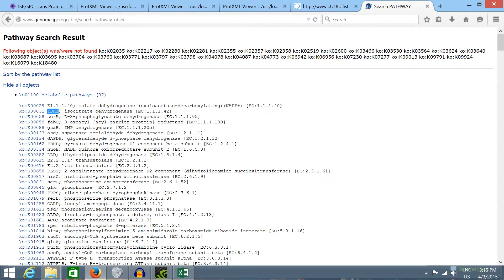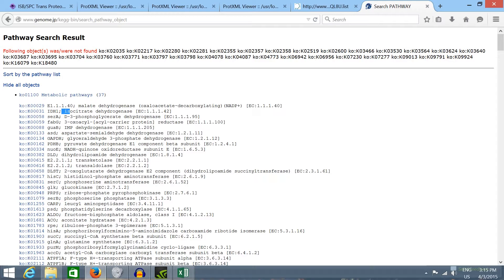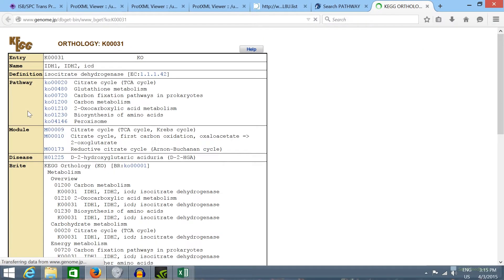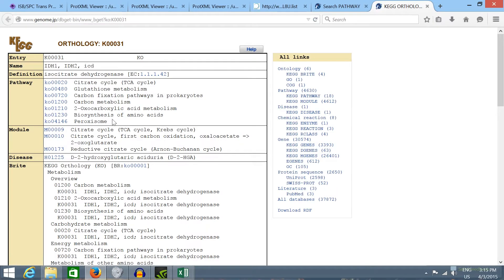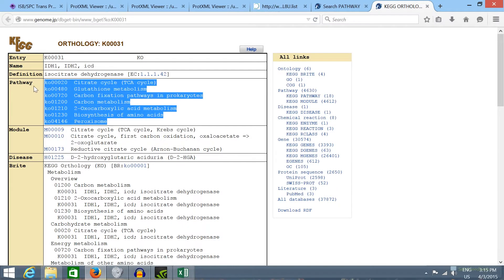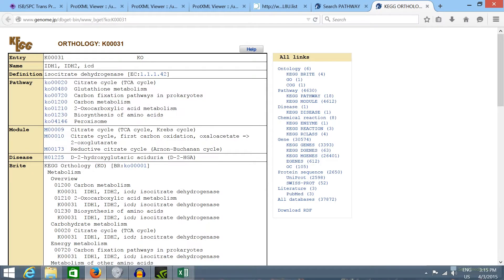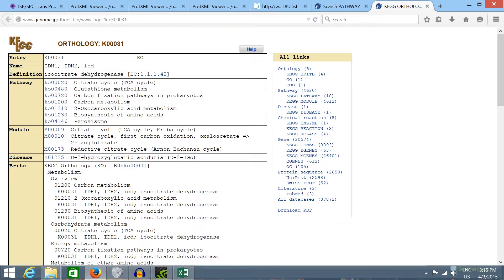If we click in one of these enzymes, like the isocitrate dehydrogenase from the carbon metabolism, we'll see in what metabolic pathway this enzyme that was identified in our proteomic data is participating in.